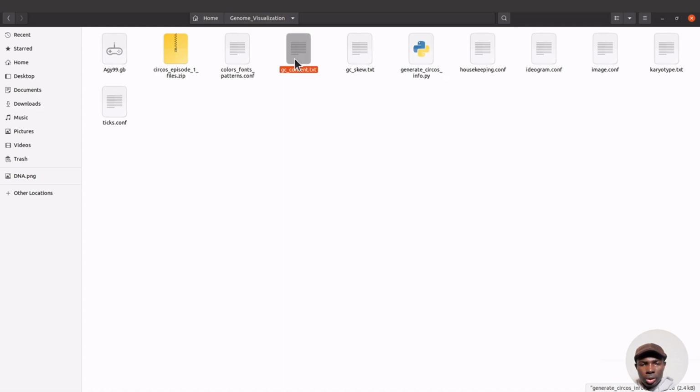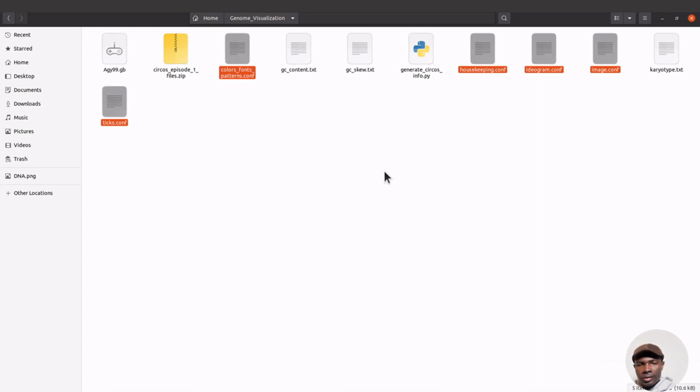So in addition to this and then this and then this, you also need to make sure you have this one, this, and then this. You need all these files.